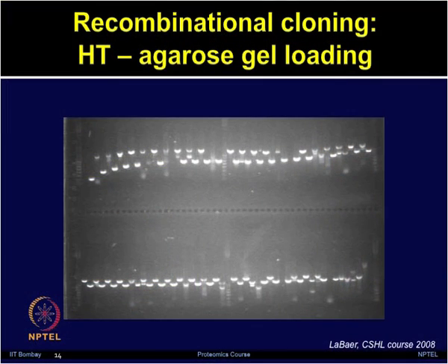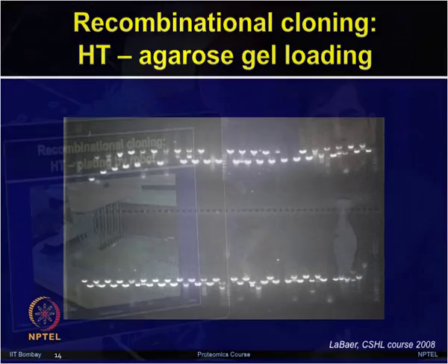In the gel here you can see the sawtooth pattern for loading the gels, which makes the band size identification easier and avoids contamination from the neighboring lanes. By loading in an alternate way, you are avoiding the contamination which can go to the neighboring wells due to overflow of the sample, and also you can easily identify your sample and the molecular weight.